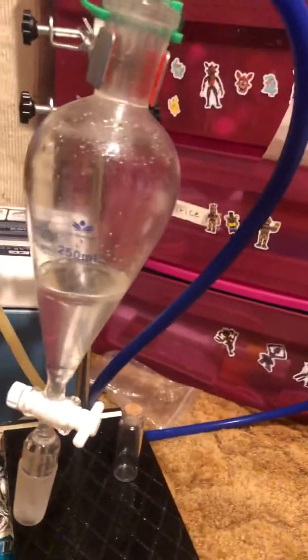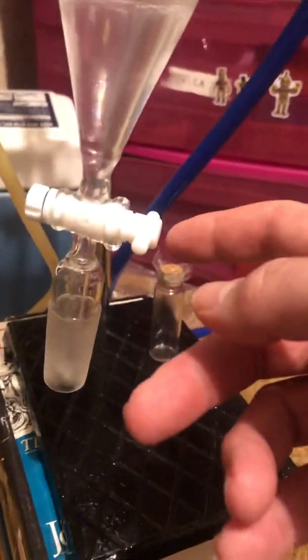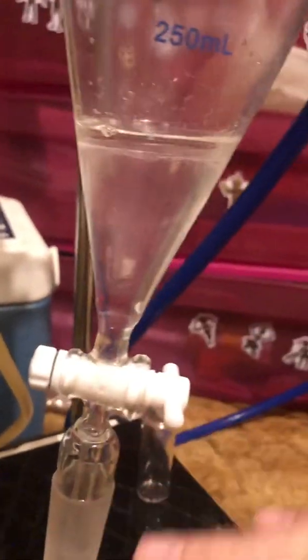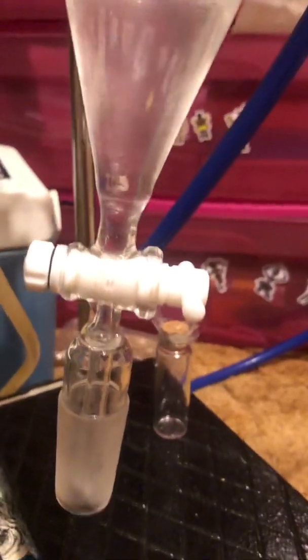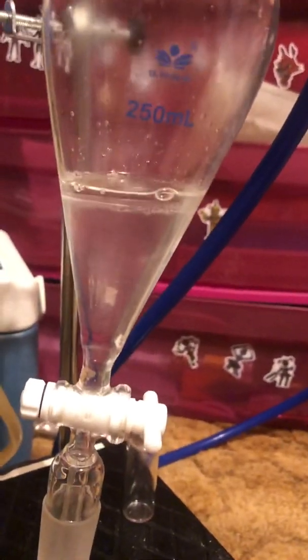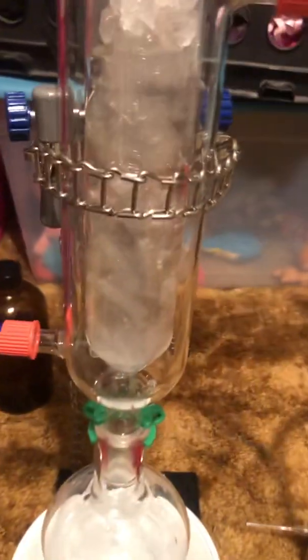It drains down into this oil separator — here I've got a stopcock, which allows me to open and close it. Being that essential oil is less dense than water, it floats on top. So you open this up, you can get all the hydrosol out first, then switch out your receiving flask and catch that last little bit of lavender oil. There's also an ice trap here catching any remnants of vapors that didn't condense — the ice water helps that small bit of vapor condense again and drop into the receiving flask.